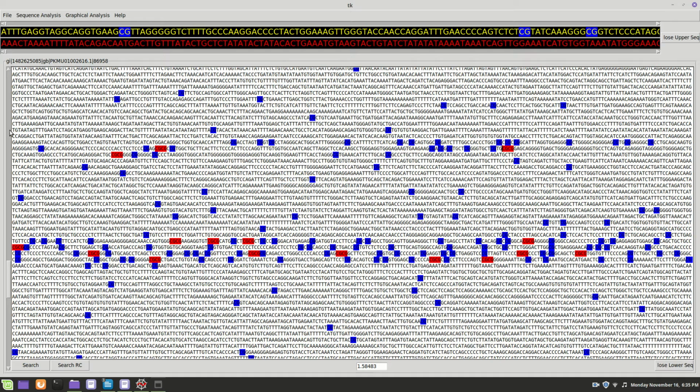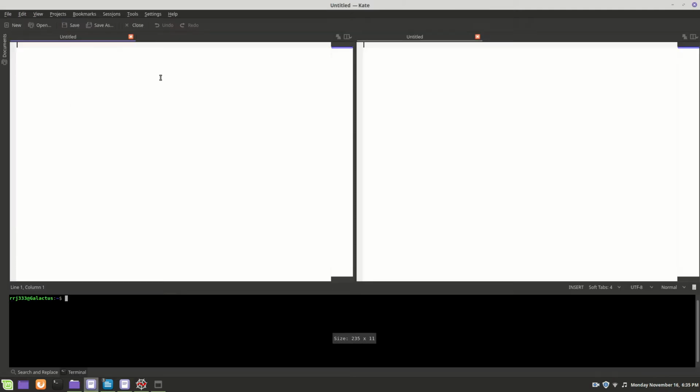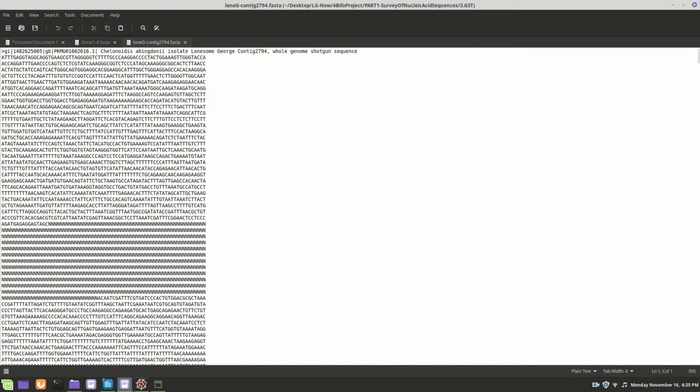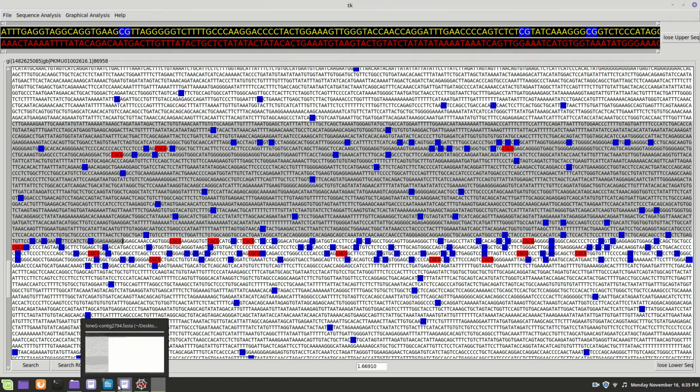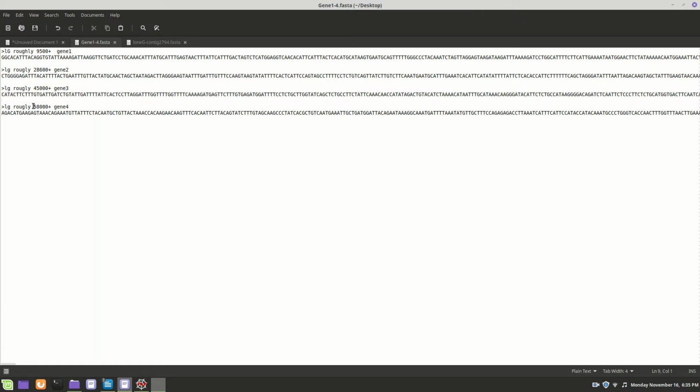All right, so you would grab it right about here. That's at 58 too. So anywhere in here, grab that, and I'm going to go down to the next gene. And I'm just going to copy this piece, and I take this piece here, and I put it into the FASTA file for you guys. Oops, wrong program. The FASTA file. Let me get it back up here. Right here. And so that would have been the last one. Yes, I started at 58 and I went forward to the next gene. So that's gene 4.